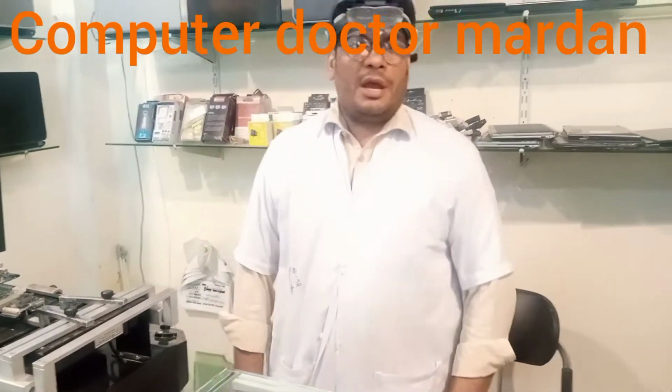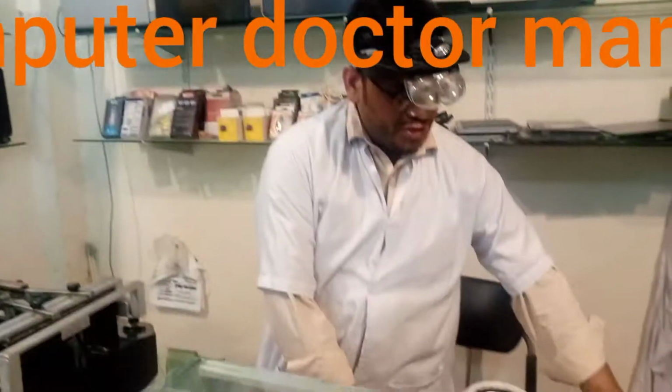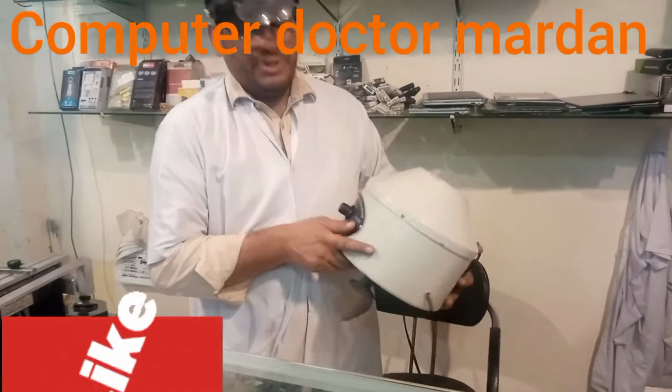Today I will explain to you how to repair this centrifugal machine.